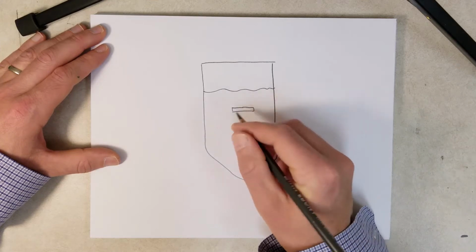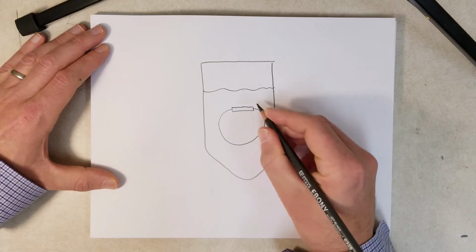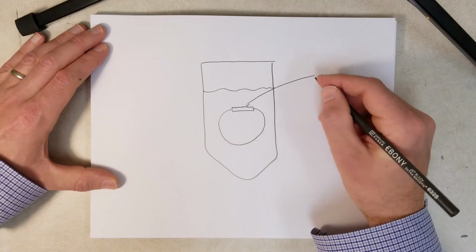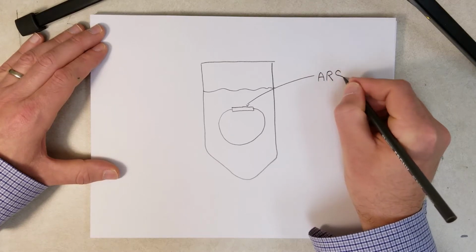In this case, I'm going to add a circular DNA molecule, and that DNA molecule should have an origin of replication. So in this case, I'm going to add an ARS from yeast.